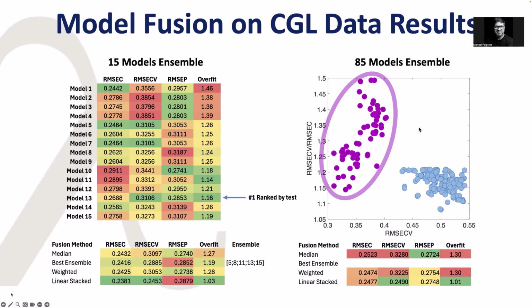It's just that sometimes we find in this overfit versus error plot that there are some clusters of models. So I prefer to just keep that cluster because it seems that there is something common with them, at least performance-wise. The important thing, and this is the underlying tone in that conversation about ambiguity and diversity, is that you will see that when these ensembles are successful, it's usually because we have a lot of different kinds of preprocessing in them.